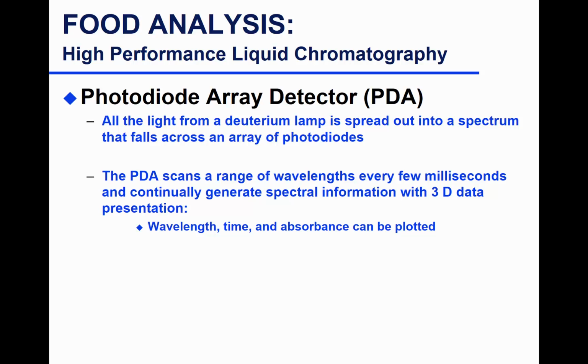So you will have for every compound a spectra, a unique fingerprint that shows you at which wavelength that compound will absorb. Some of them, the ones we looked at as different peaks in the coffee, let's say, had different maxima. They absorb at 2 different lambda maxes, not only one. So they really differ. So every compound is somewhat unique.